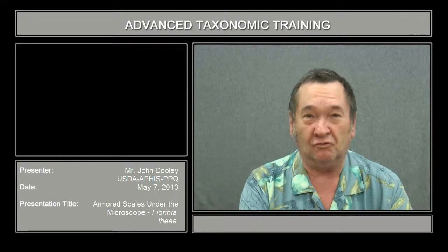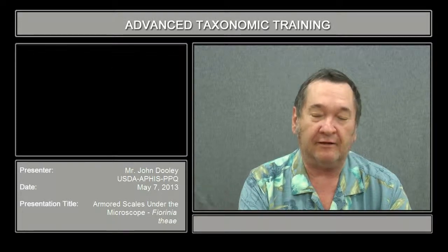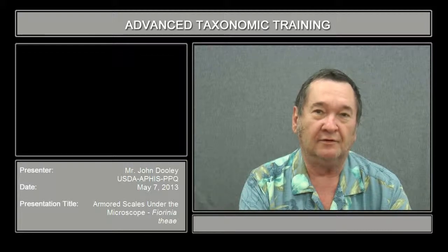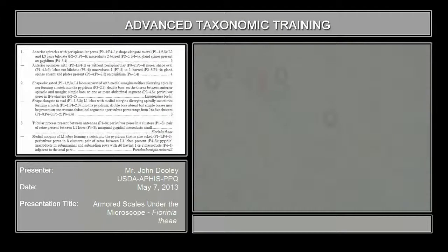Hi, my name is John Dooley, and I am the entomologist for the United States Department of Agriculture, Plant Protection and Quarantine at San Francisco, California. My specialty is that I identify all of the whiteflies and armored scales that accompany shipments coming into the country from all over the world. Pull out your Fiorinia theae.